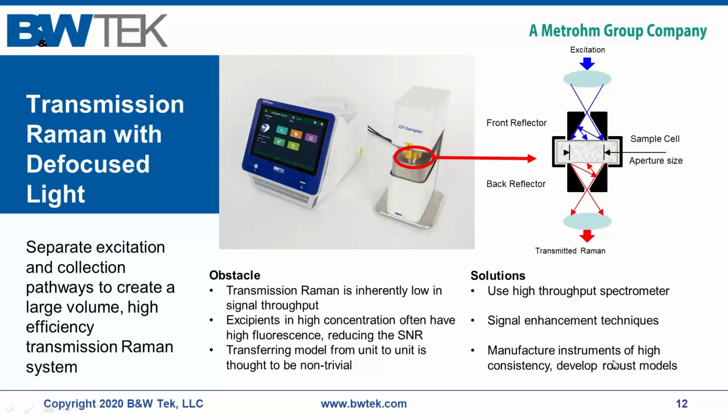Have you tried the instrument for API quantification in capsules? I have, and unfortunately I don't have the data in front of me, but there are some capsules that it's a little bit more difficult for the light to penetrate. So it does not work for every capsule, I have to say, depending on the capsule thickness. The important thing here is that our light can get through the capsule material and then through it on the other side as well. And depending on that gelatin material and the color of it, that can be challenging. So I can't say that this will work for all capsule formulations.